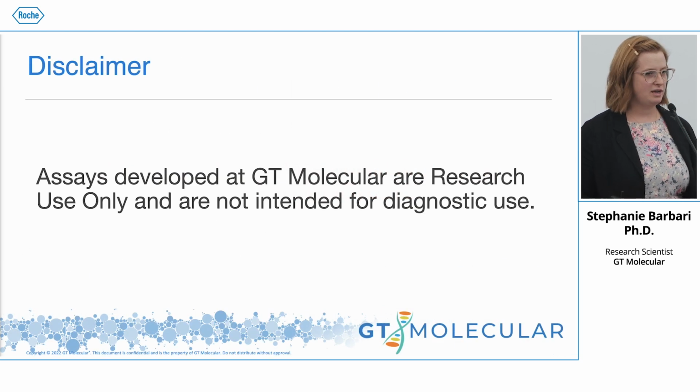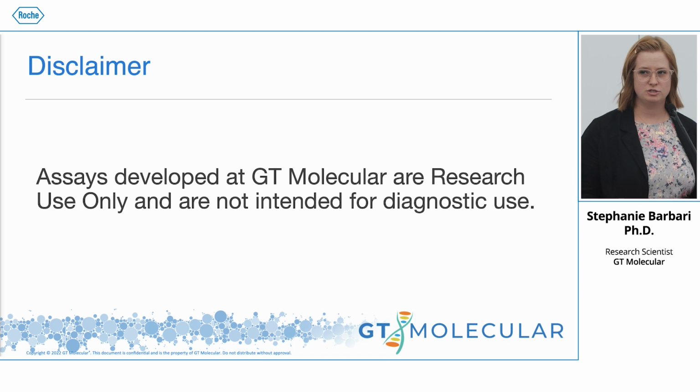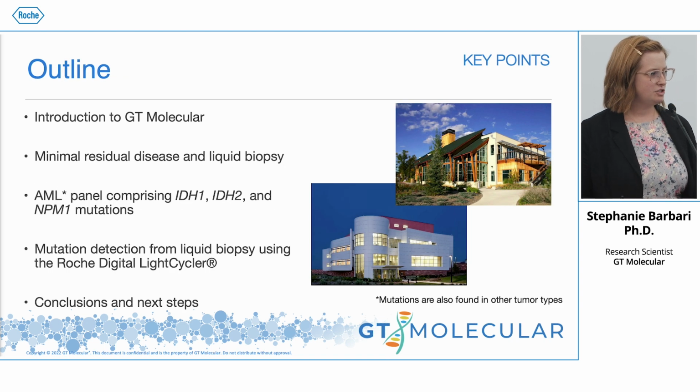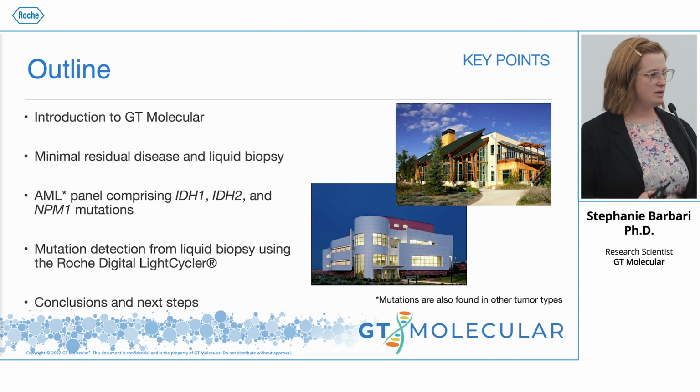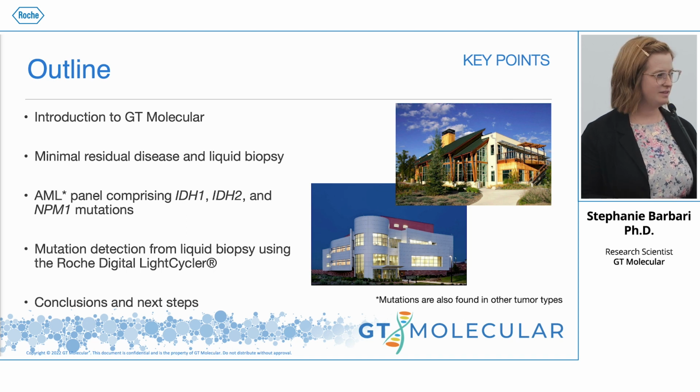Just a quick disclaimer, any assays that are developed at GT Molecular are research use only and are not intended for diagnostic use. Just a brief outline of my talk, I'll give an introduction to GT Molecular and tell you about who we are. And then I'll give some background to minimal residual disease and liquid biopsy. And then I'll present our AML panel comprising mutations in IDH1, IDH2, and NPM1. And then I'll showcase data from our assay on liquid biopsy samples using the Roche Digital LightCycler, and I'll finish with conclusions and next steps.